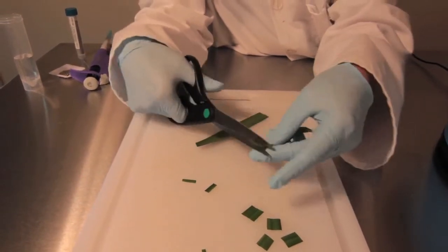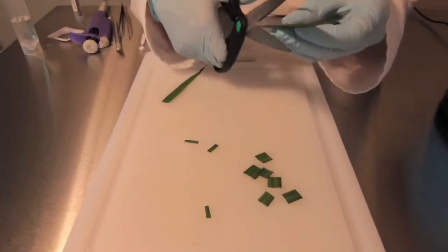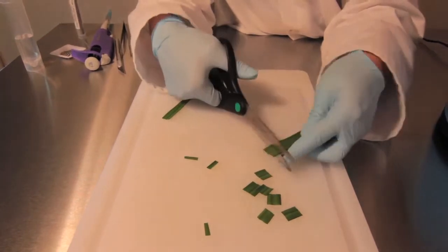If you are homogenizing leaf samples, cut them into pieces that are about half an inch by half an inch.